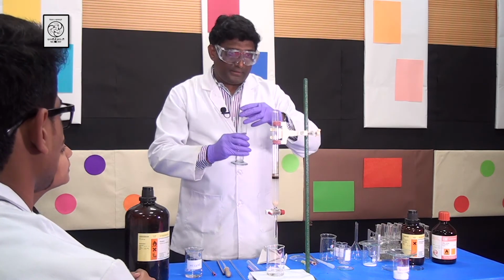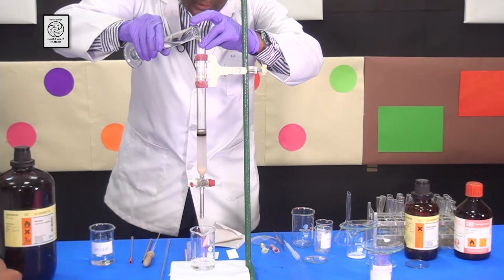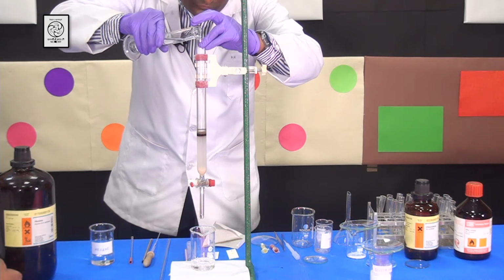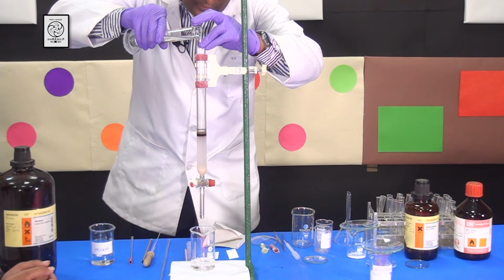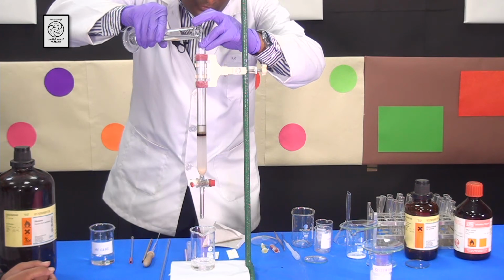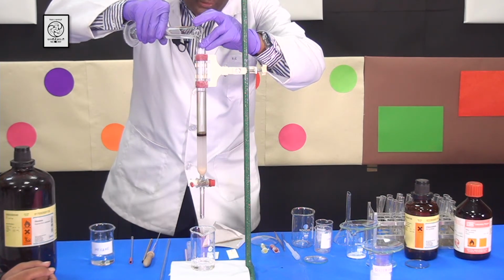Now I am going to pour it very carefully so that I don't disturb the top layer. Initially, for a few milliliters, you can pour carefully, then later on you can increase the speed and fill the column.